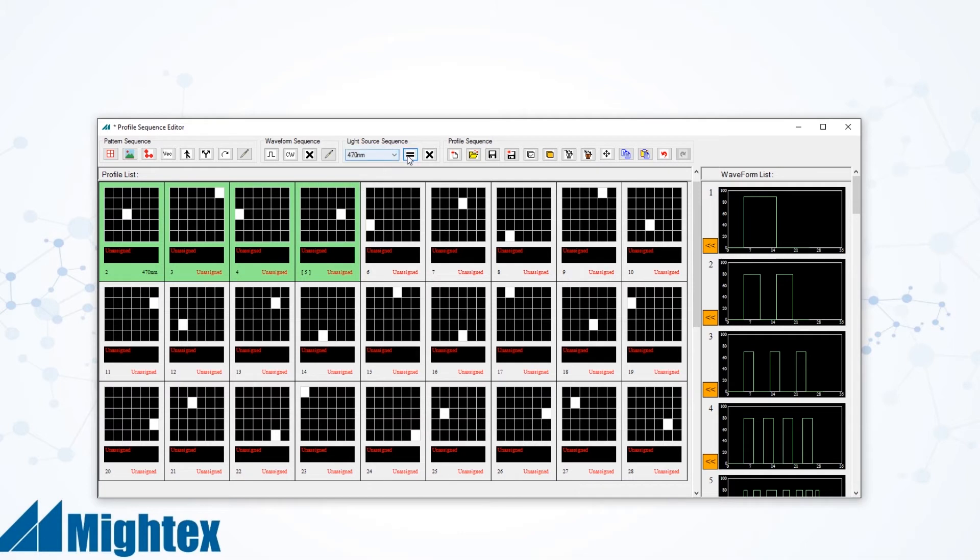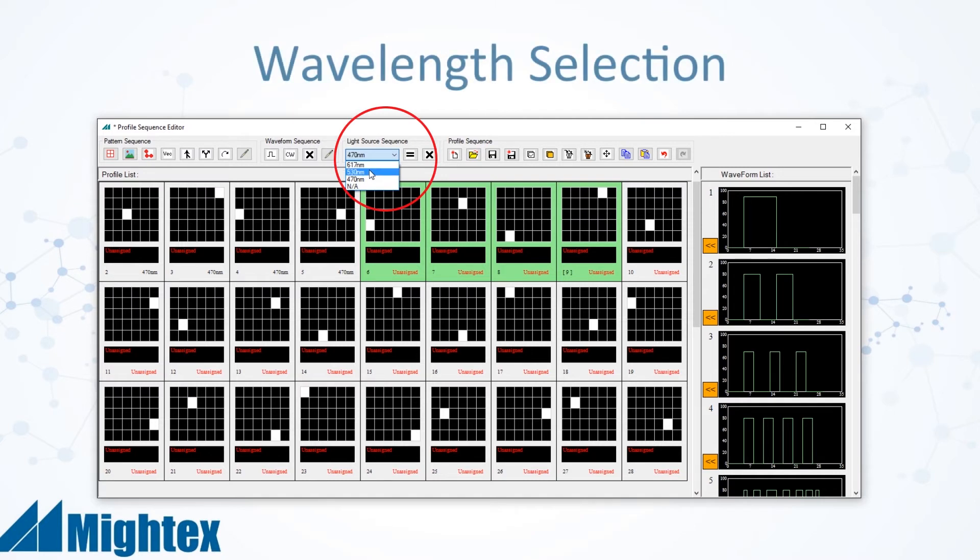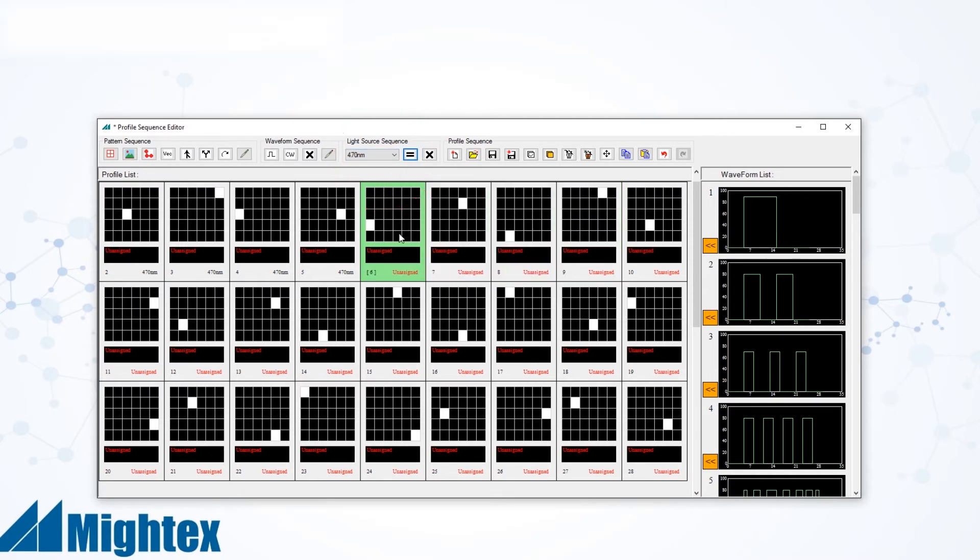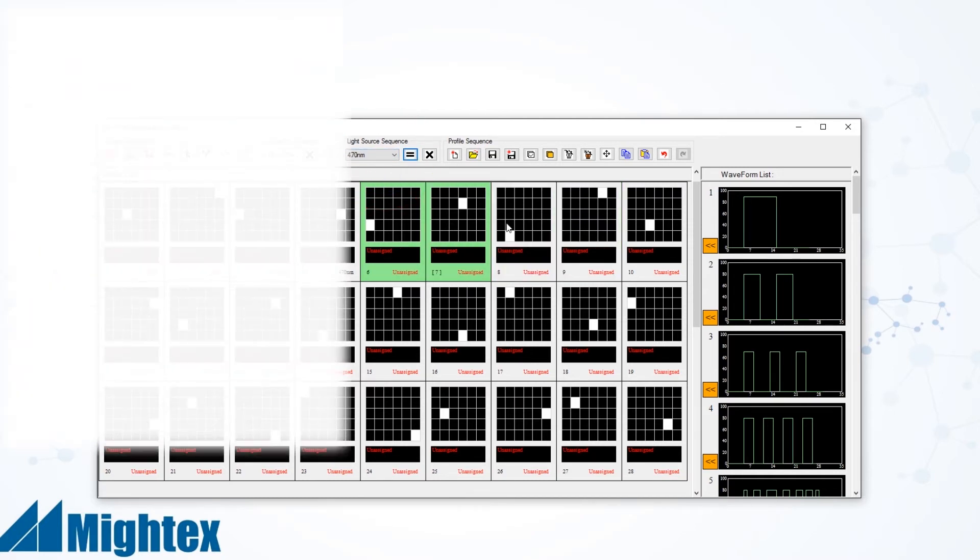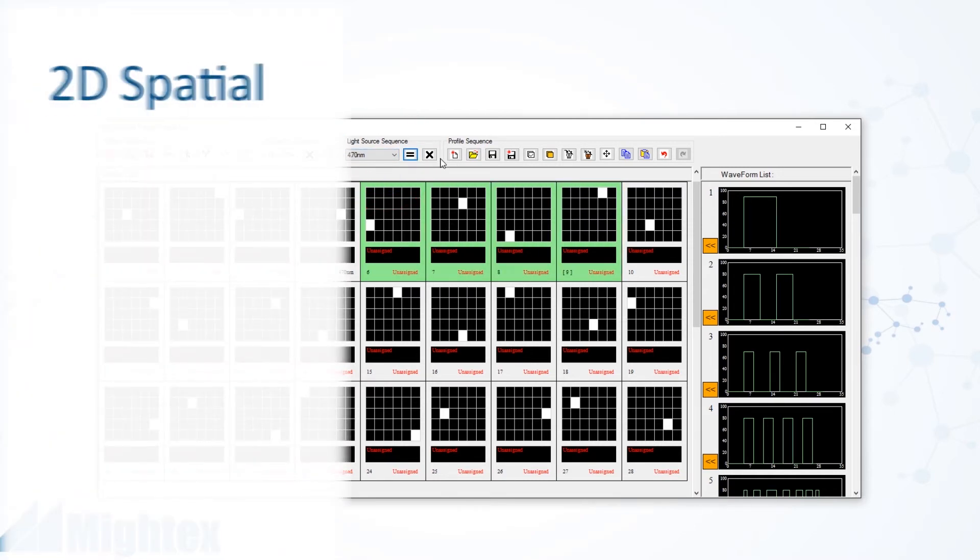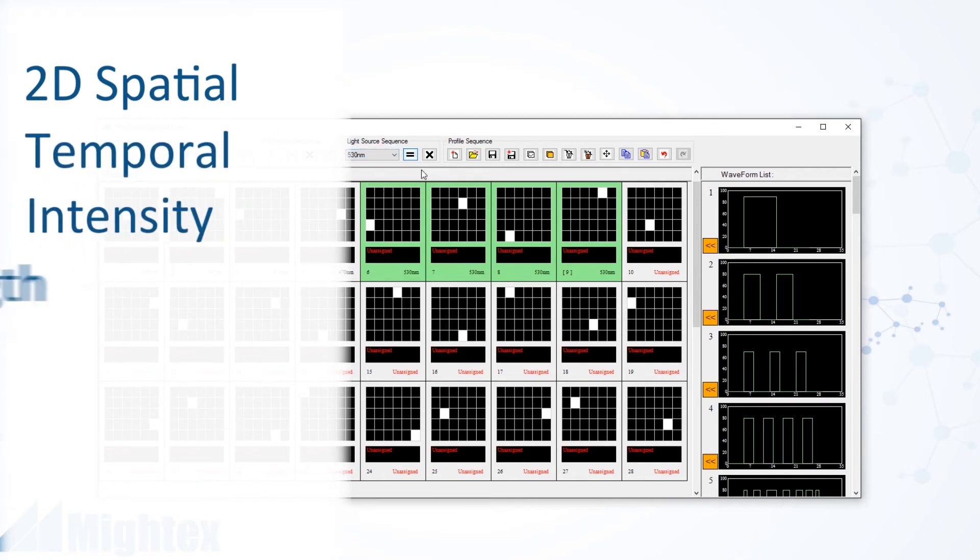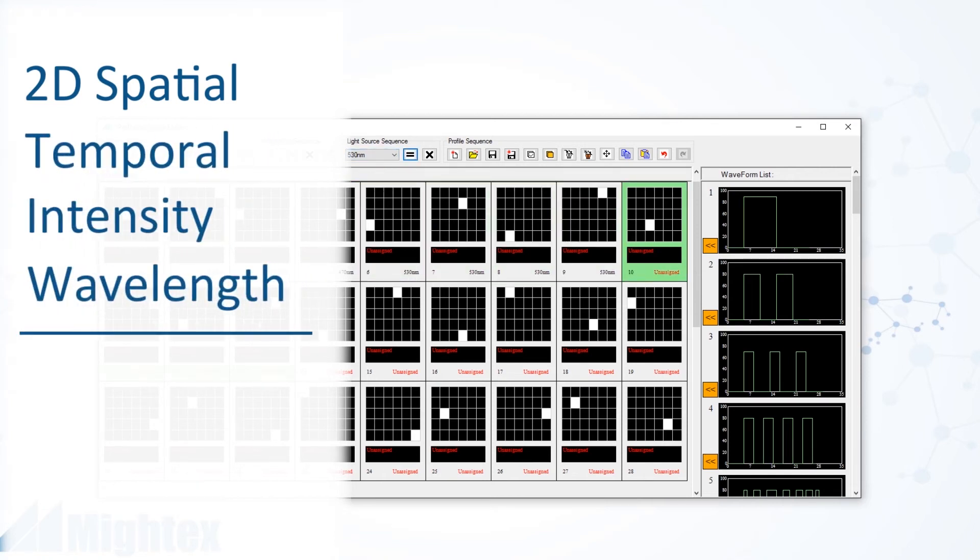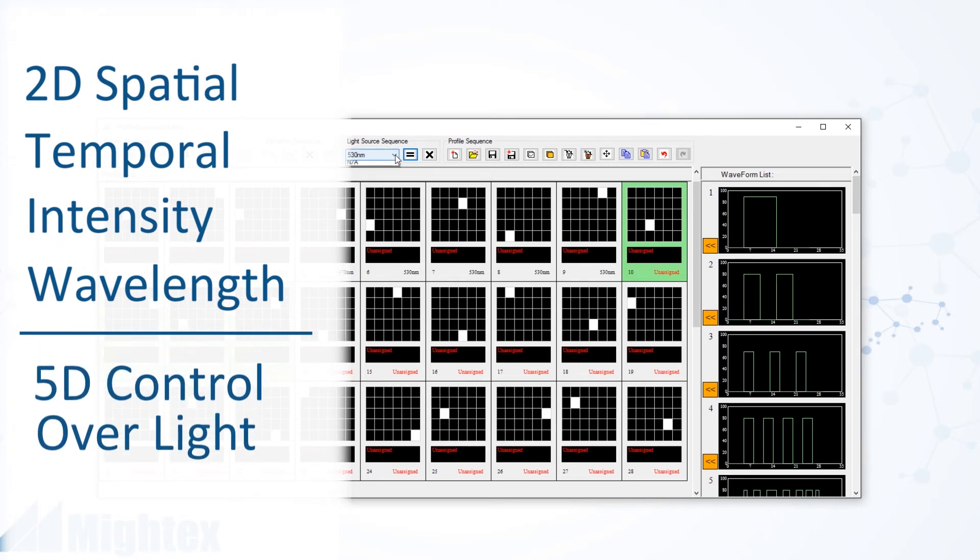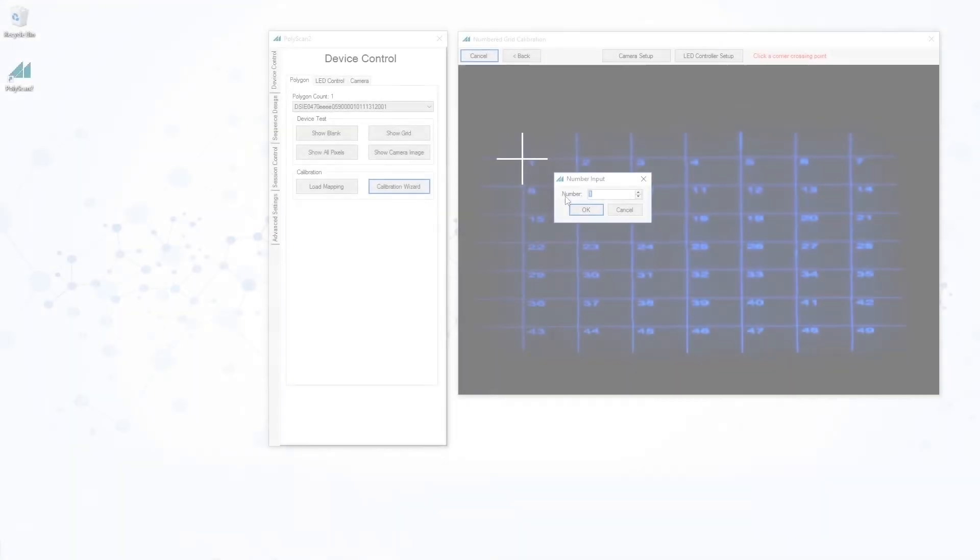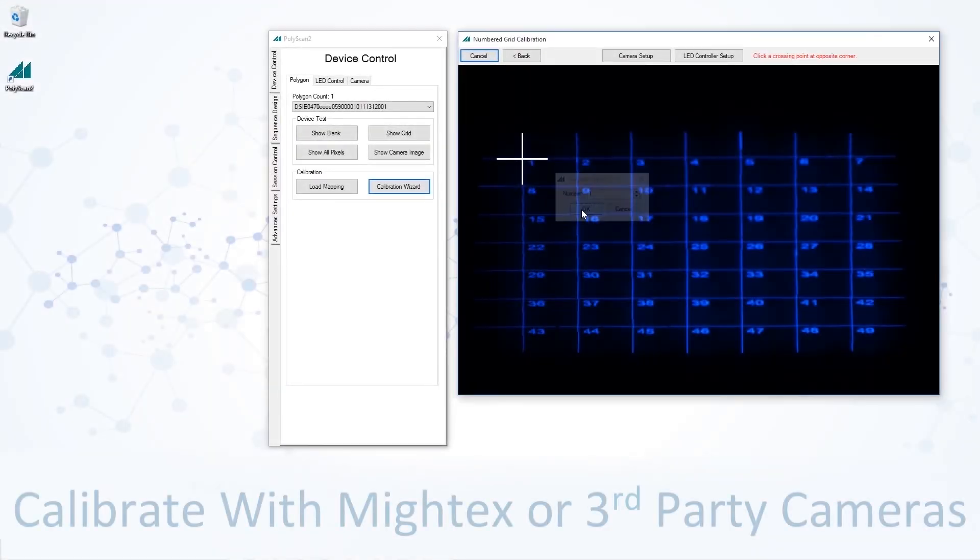And because PolyScan now controls Mightex LED controllers, users also have the ability to assign wavelengths to each illumination pattern. The ability to assign each 2D spatial pattern with temporal, intensity, and wavelength parameters allows PolyScan to give you five dimensions of control over light.